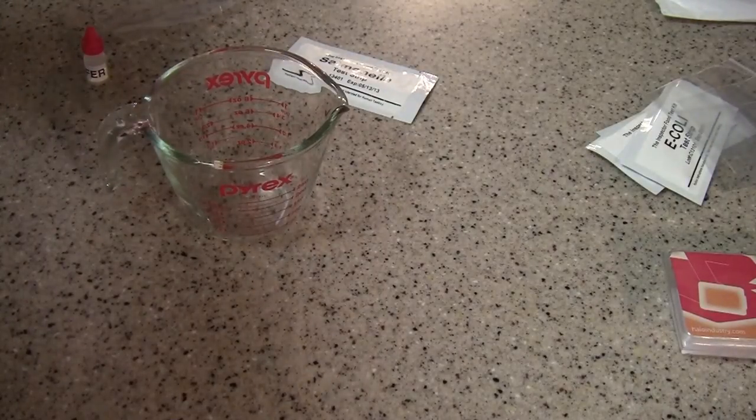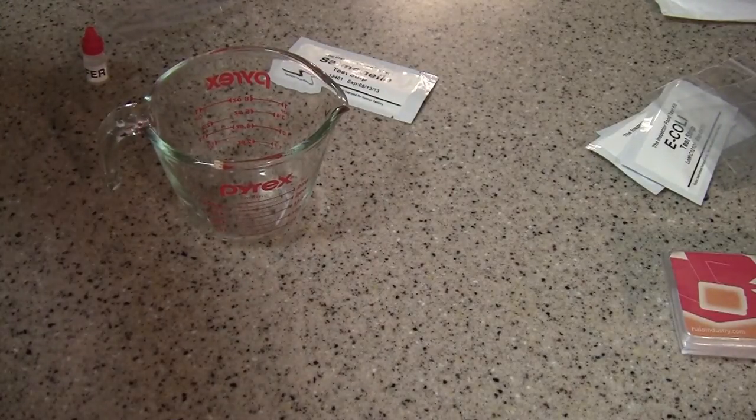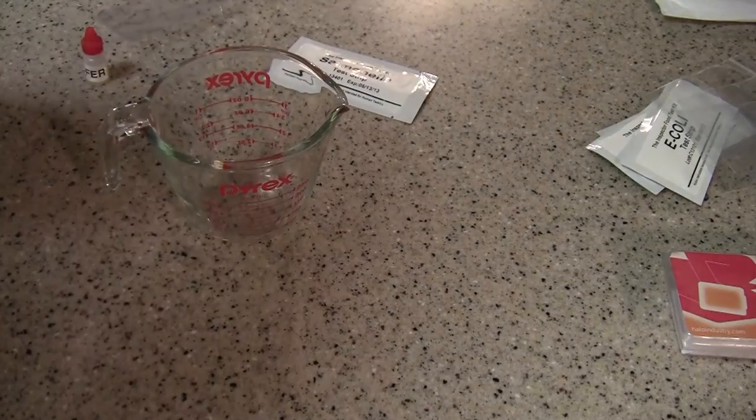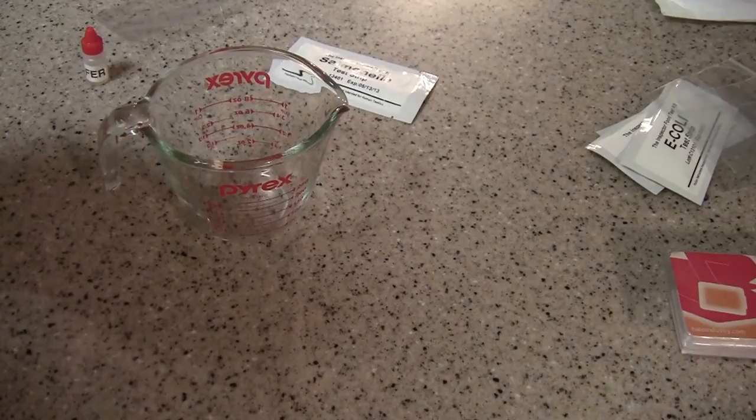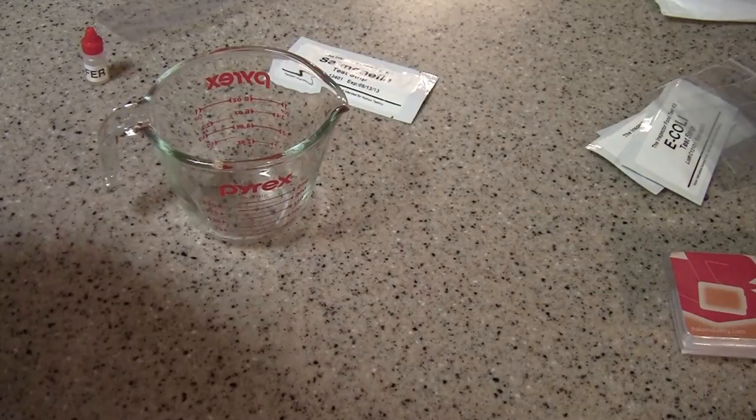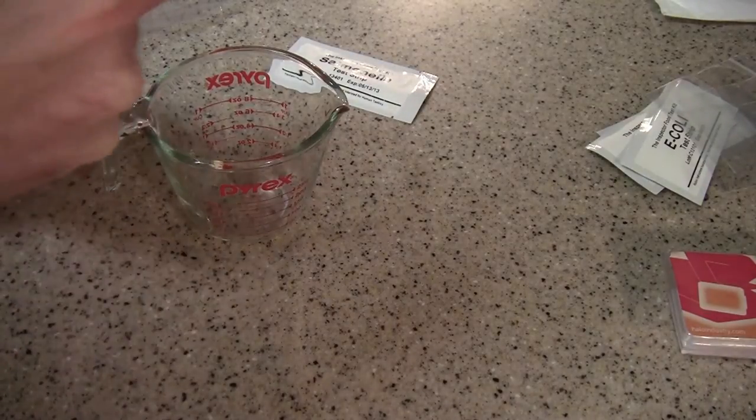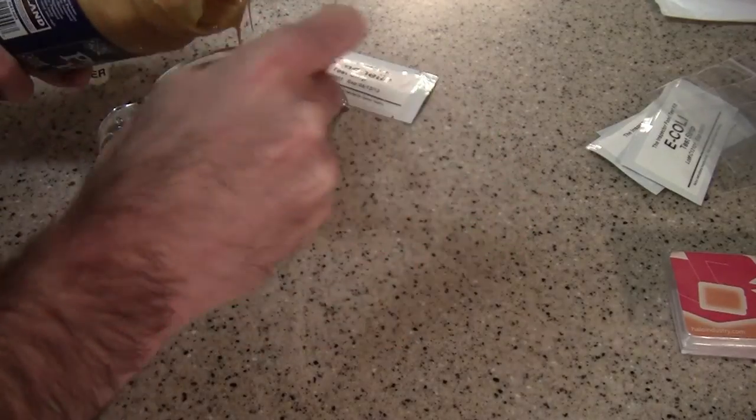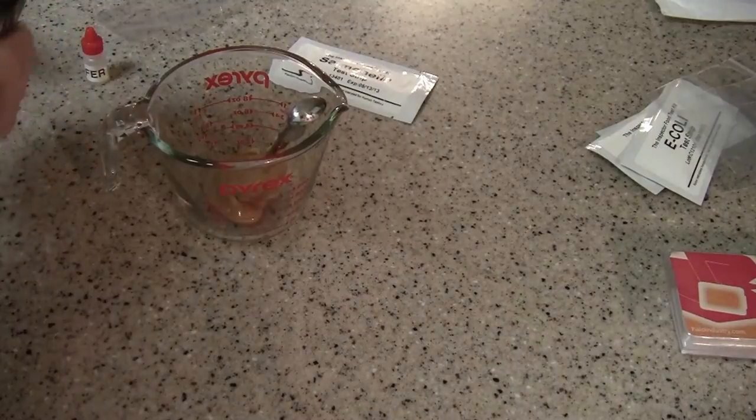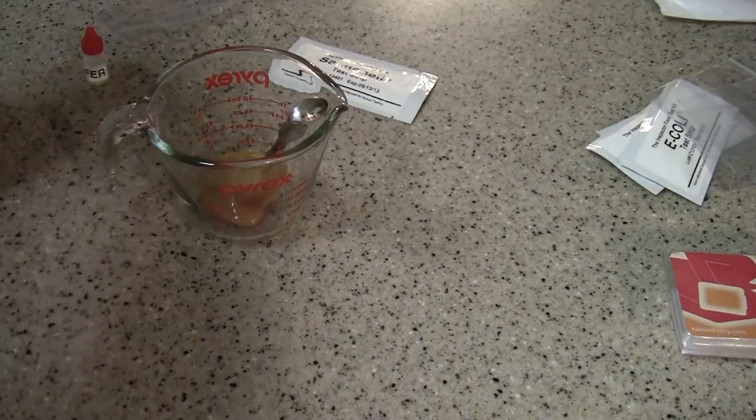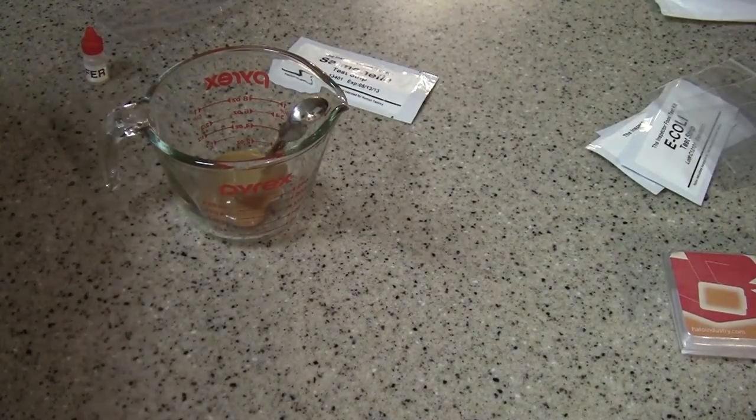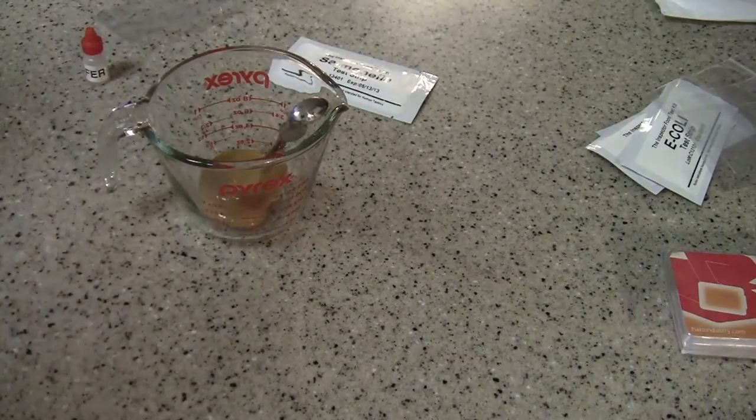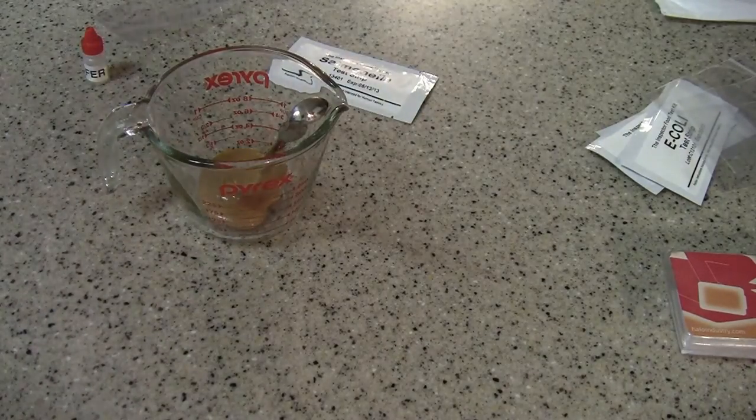And what you do is you have to make a solution. The instructions recommend, if you're testing a piece of fruit, for example, that you wash the fruit in water and then you retain that water and that solution is used to test for E. coli or salmonella. Now with peanut butter, that seems a little bit different because obviously you can't wash peanut butter. So what I'm going to do is I'm going to put a fair amount in this Pyrex measuring glass.